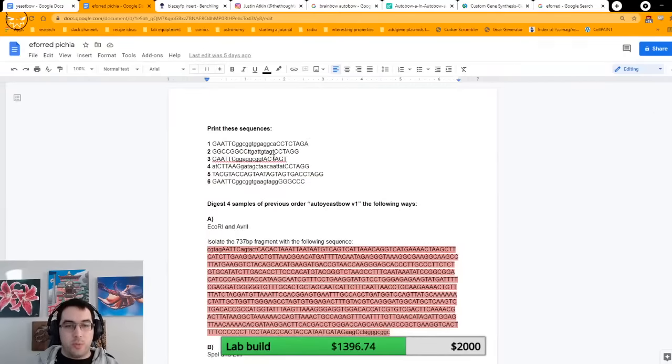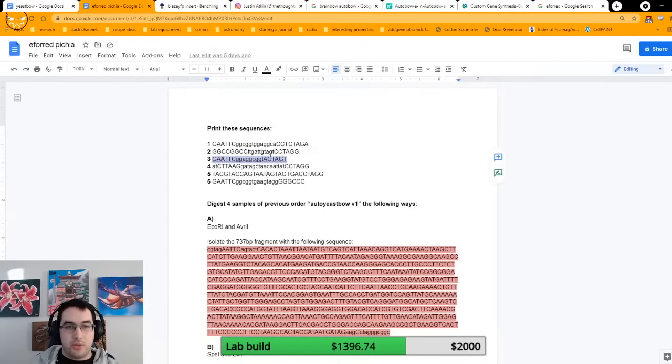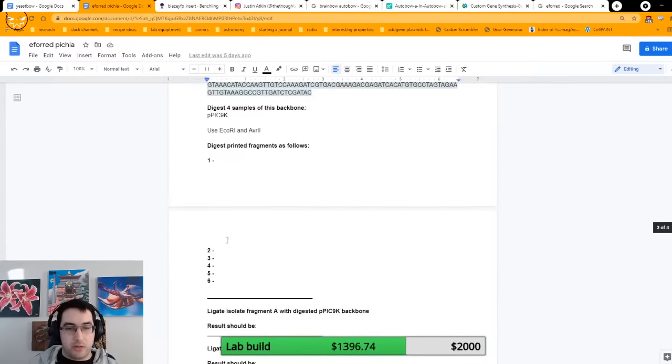I need to find which of these adapters need to be digested with which enzymes. So let's do that. This one, ACT-AGT, I think is the ACT-AGT. Yep, it's this one. I just happen to remember that because I was looking at it a second ago, but this one, which I think was number 3, needs to be digested with SpeI. So that was number 3, so we go down to here, SpeI.